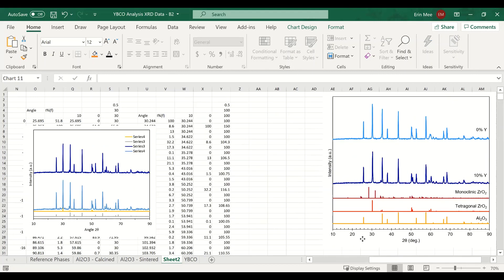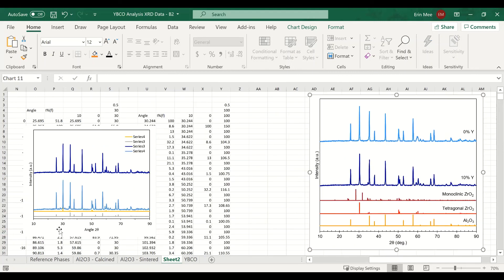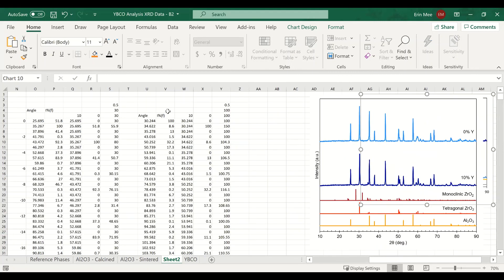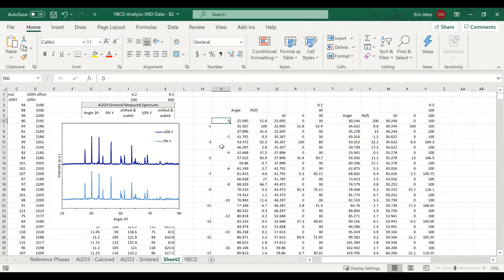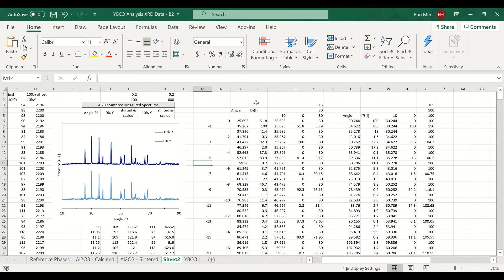Key takeaways from this method: use the OFFSET function, repeat angles three times, and use an index column going zero, negative two, negative four every three cells. For intensity values, use the index negative one, negative three, negative five every three cells.